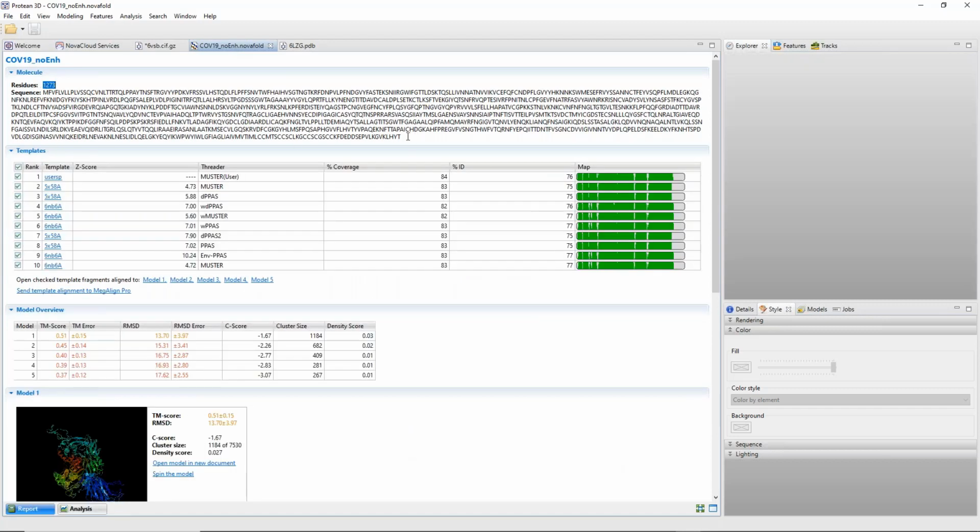And you can see here, this is the size, this is the full spike protein, S1 and S2 domains. And then we also supplied a user supplied template. So we had picked out a SARS-CoV-1 model as a template, and we supplied it as a user template. That's something you can do with this tool set. But additionally, the threaders that are used in the NovaFold tool chain picked out a number of SARS-CoV-1 models that were important for its modeling efforts. And really, if you look at it, it only picked out 2 models out of the non-redundant database library that we were using for this test. And that's interesting because we can go investigate these models now and see how they relate to the structure that we produced. Then if we go down to here, you can see this is the model overview.